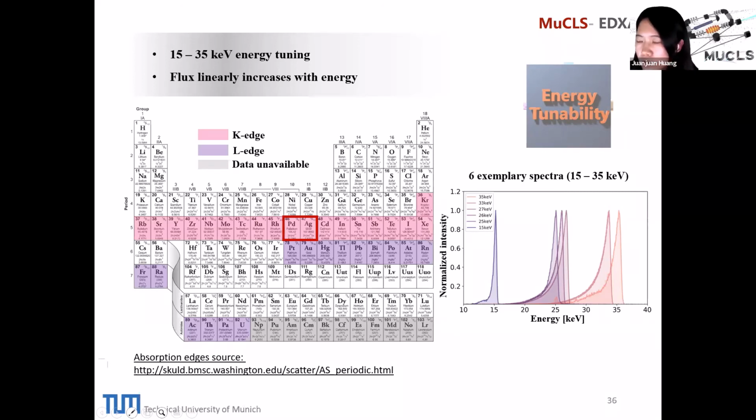Yes, there are also many other groups developing this kind of inverse Compton scattering source. However, currently ours is the only commercial one; the inverse Compton scattering source that we use is the only commercial prototype. The other groups, I think, are mostly in the development phase.